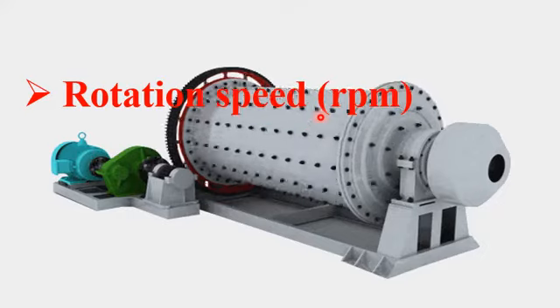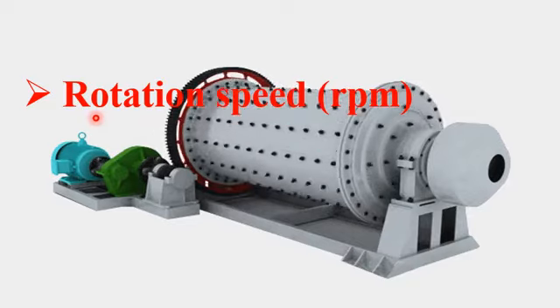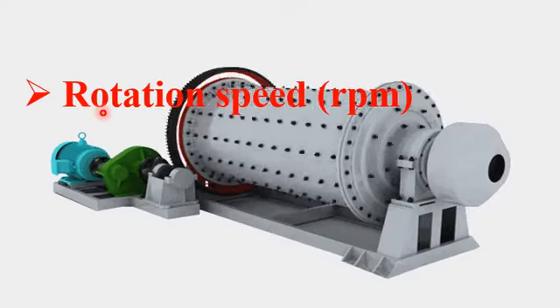Please note that the rotational speed will depend on the nature of the balls, the size of the balls, and also the material which we want to crush. All these three parameters are usually considered before using a specific rotational speed in the ball milling apparatus. Usually the rotation speed in the ball milling process is around 4 to 20 revolutions per minute.